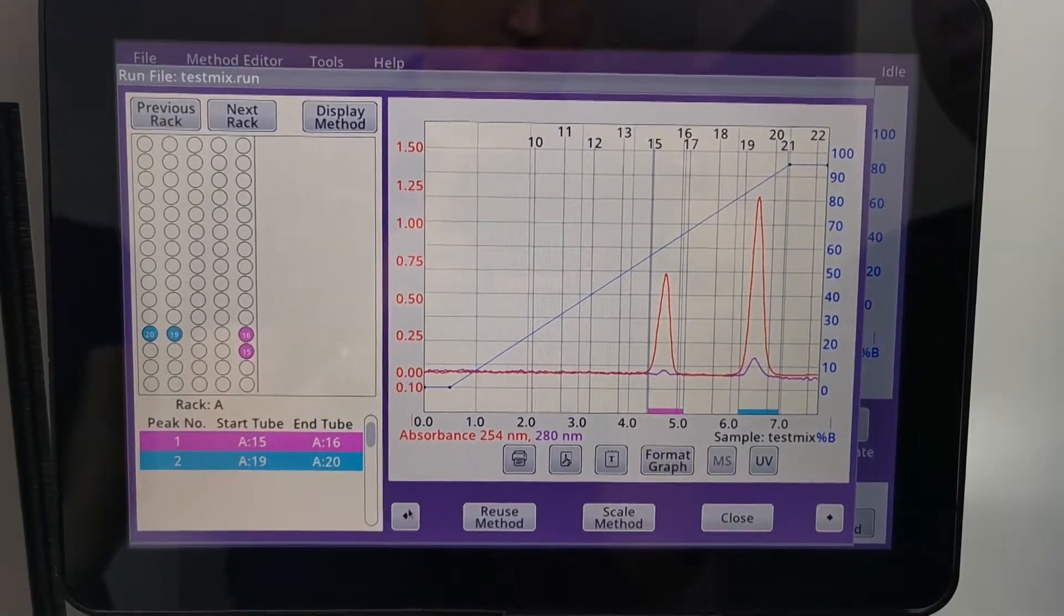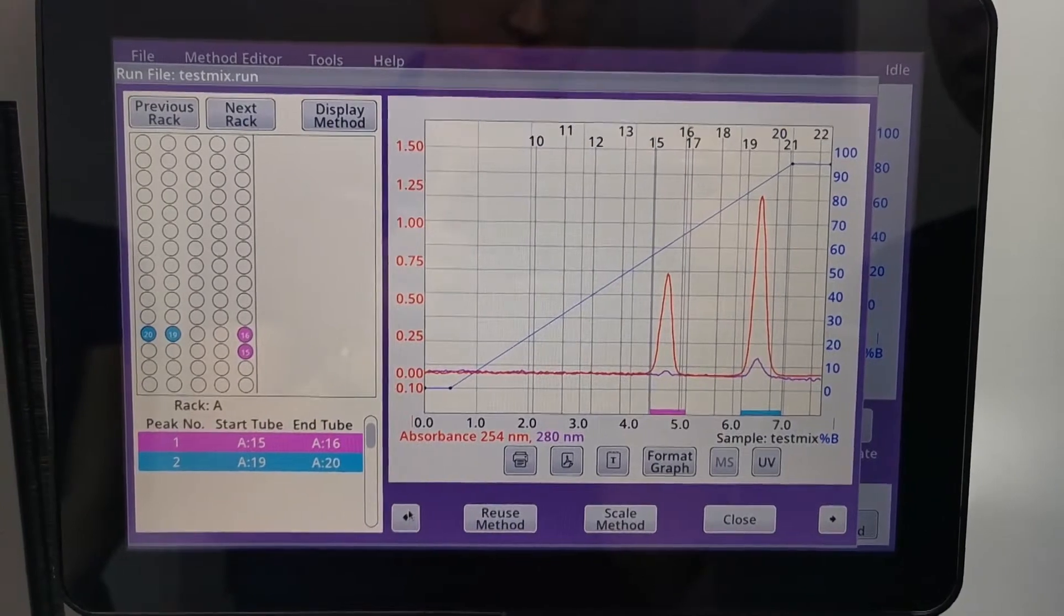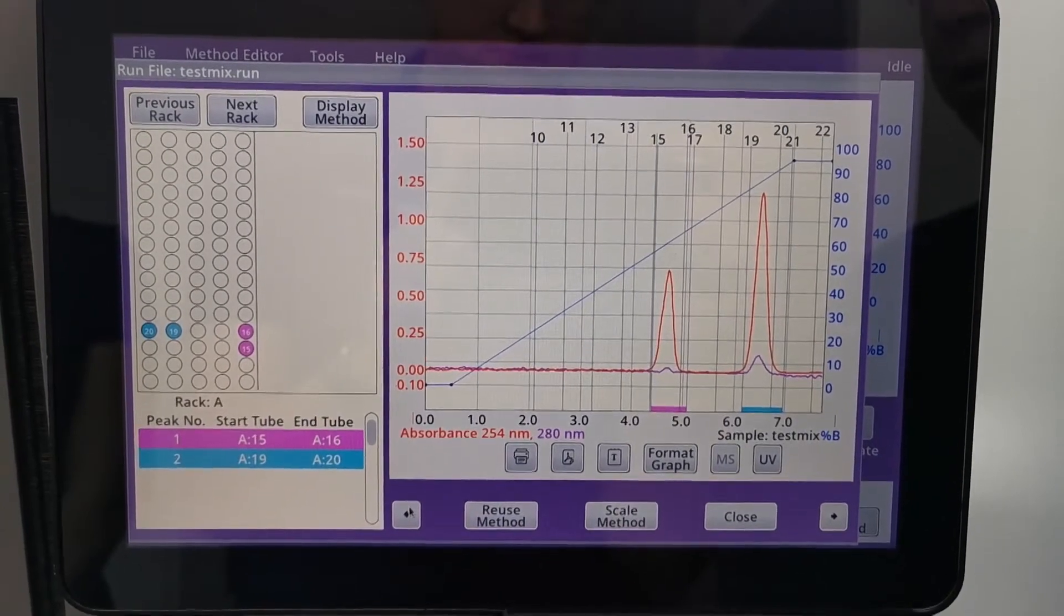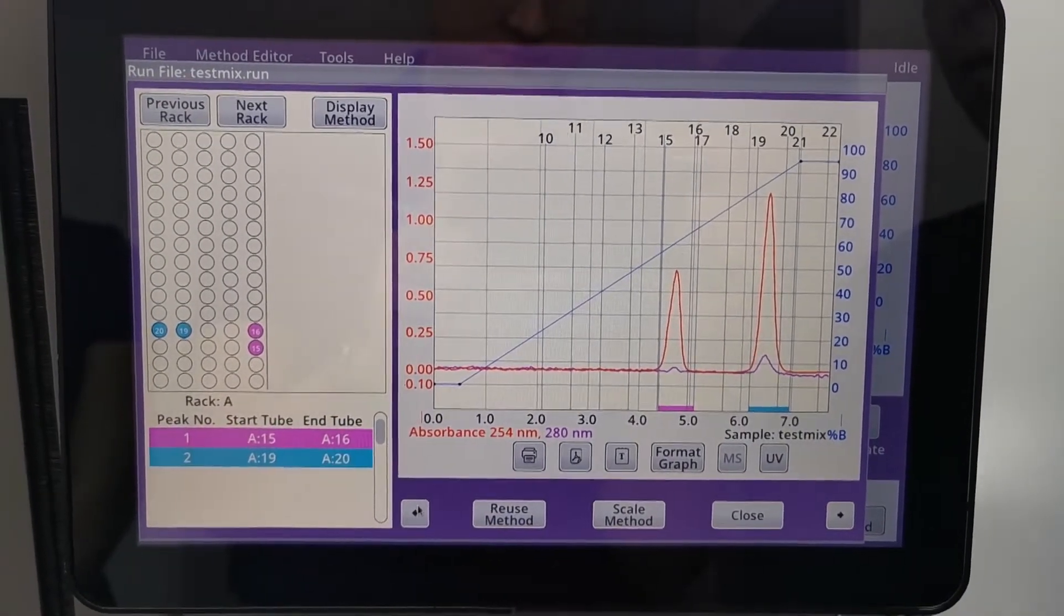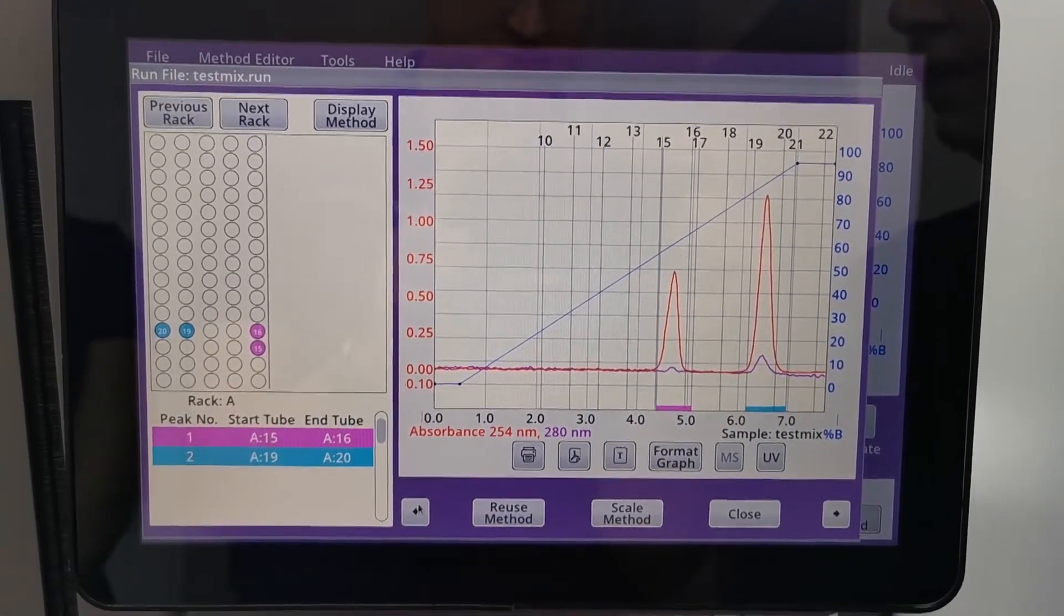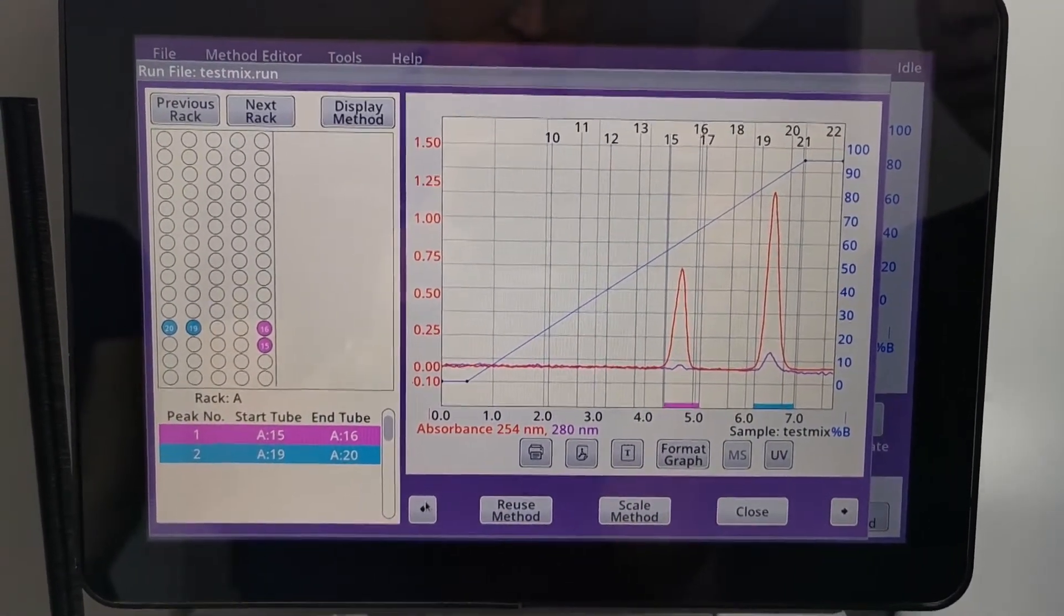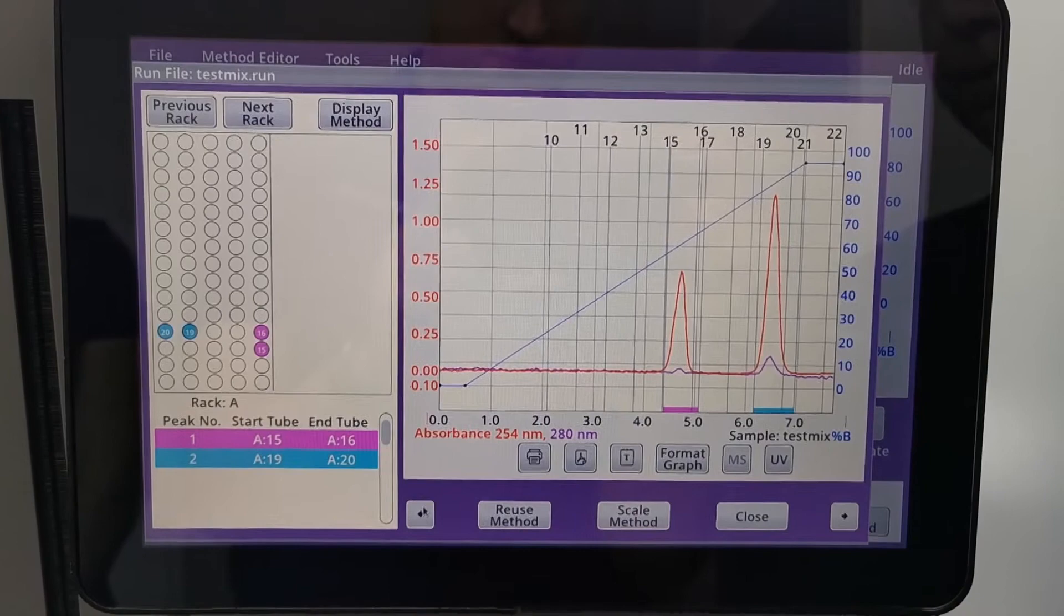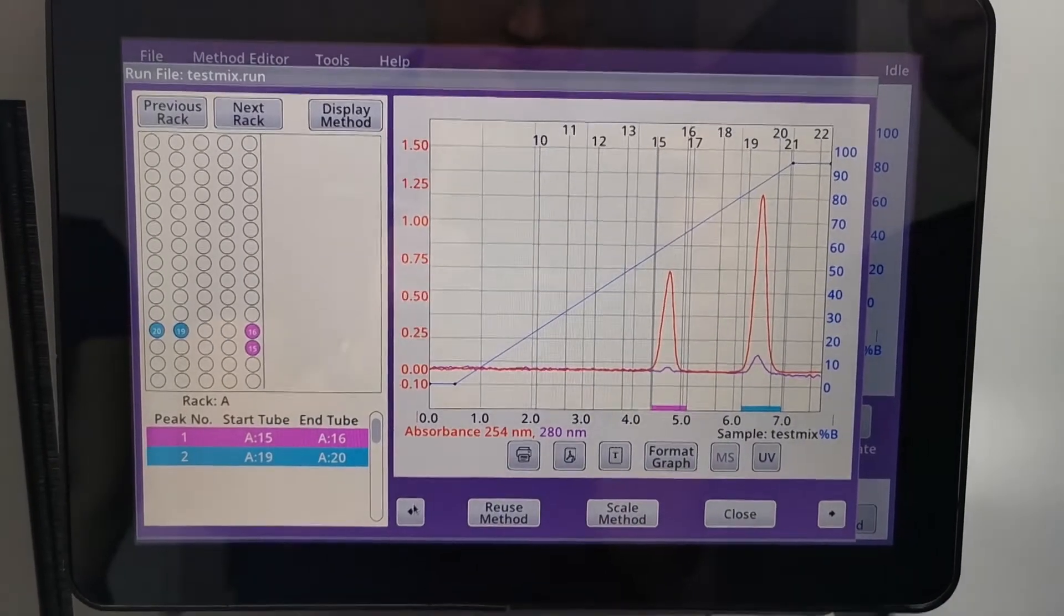This is the run that we have used on a 12-gram column. What we want to do is now scale up to a larger column and it's very simple.